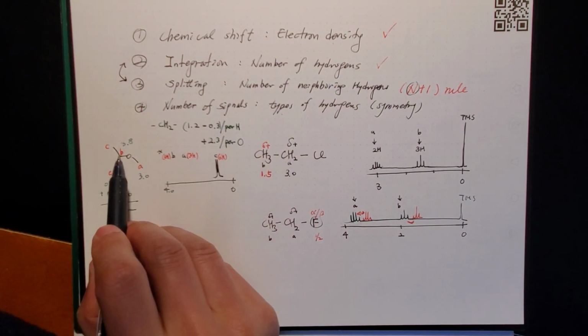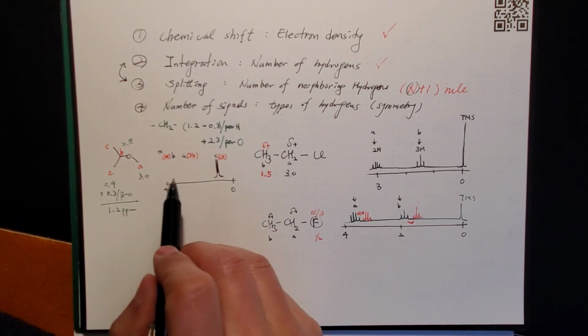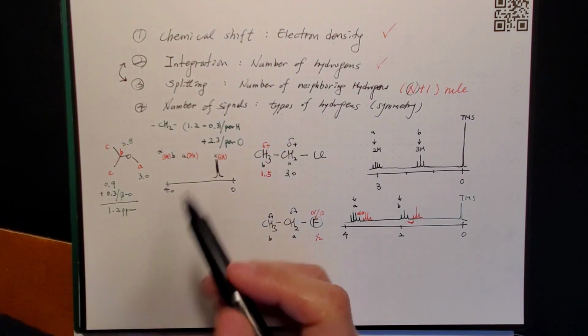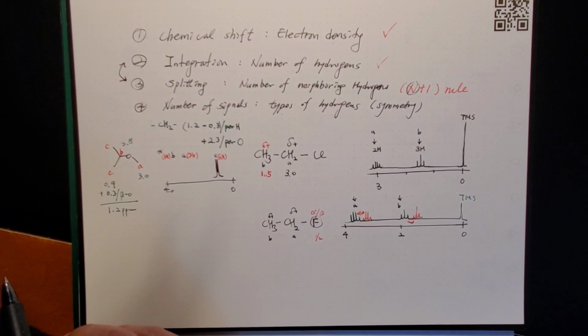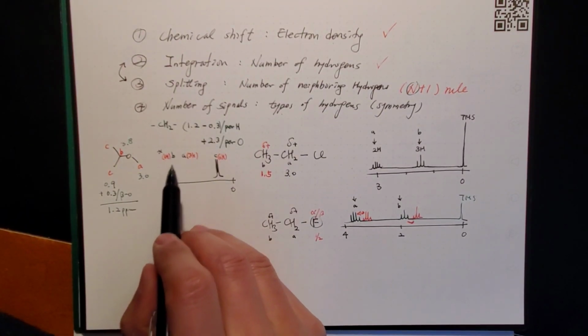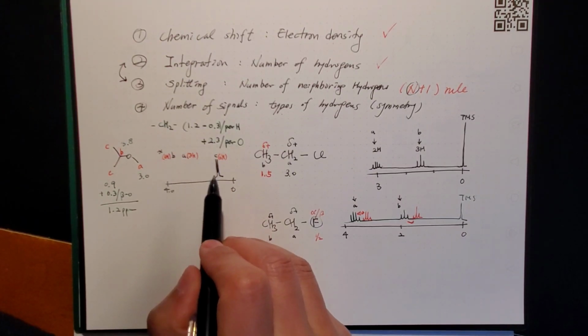Then the B has 1 hydrogen. So already 1/3 of this peak. I said one peak here is representing, roughly speaking, 3 hydrogens, because 2 lines represented 6, right? So if it's one line, it's already 1/3 of it.